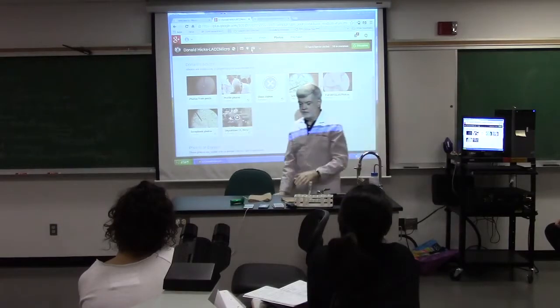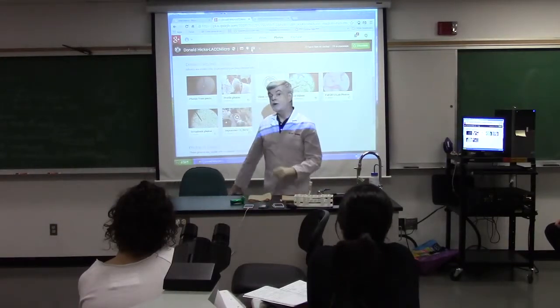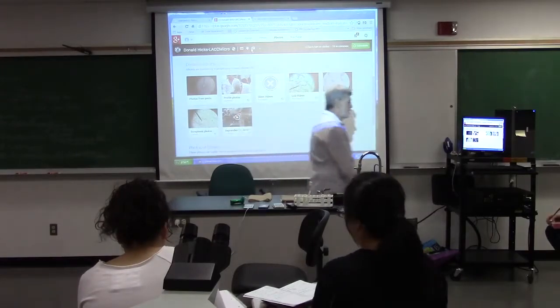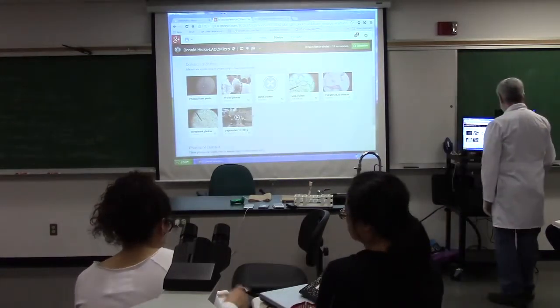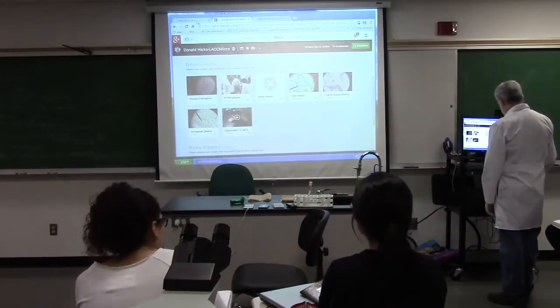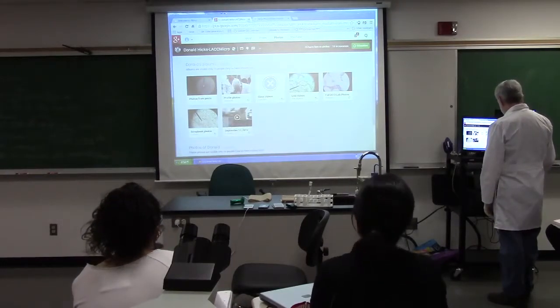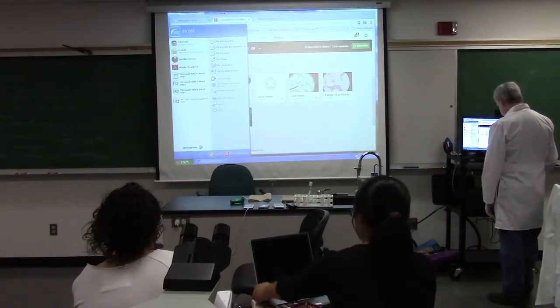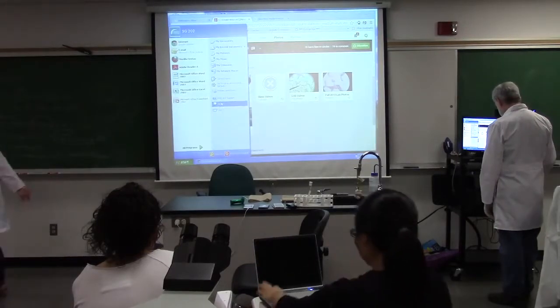Okay, so what I'm going to do first is, just to be fun, I'm going to do the demo on the endospore stain first. No, let's do the lecture on it. Screw it. Let's do the regular old thing first. Go through the regular sequence of events.